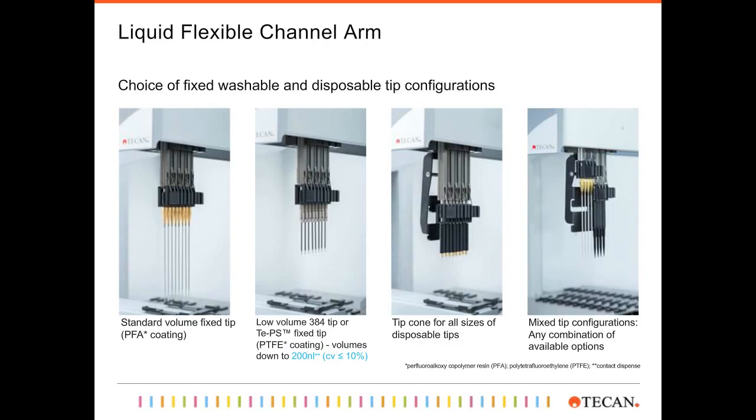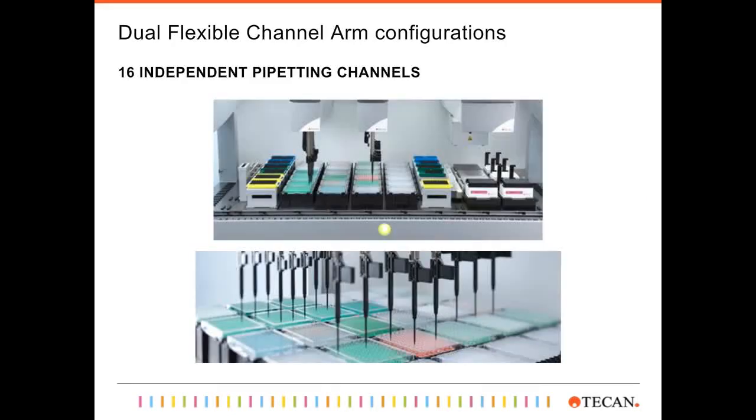So if you were doing a lot of cherry picking, work listing, hit picking, whatever these words may be that you use, these arms can spread out across the work table, aspirate all your wells of interest, and dispense it into an assay-ready plate at the end.